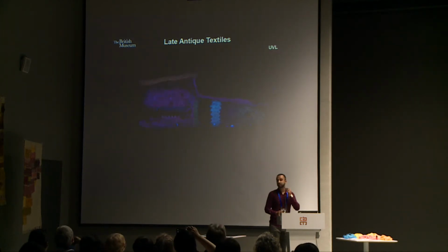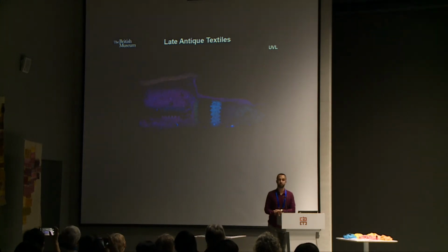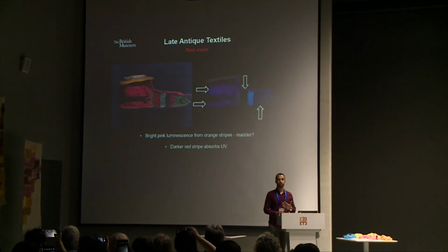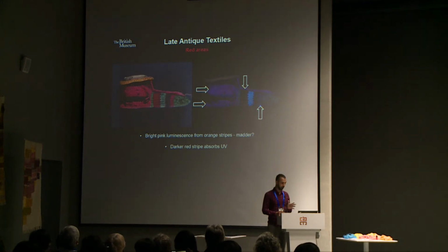And the first image that you can probably get, one of the most informative with multispectral imaging, is the so-called UV luminescence image. And the interpretation work is done by comparing the colors exhibited under the two different lights. So this is a comparison between the visible and the UV.